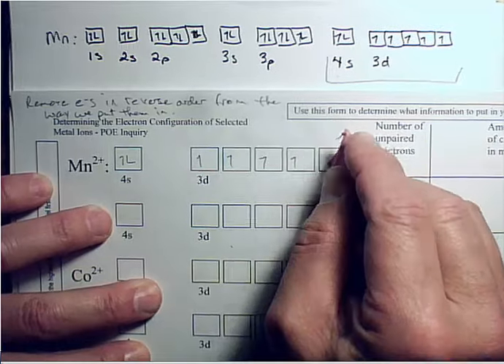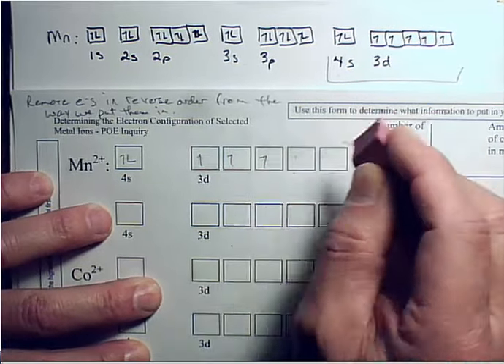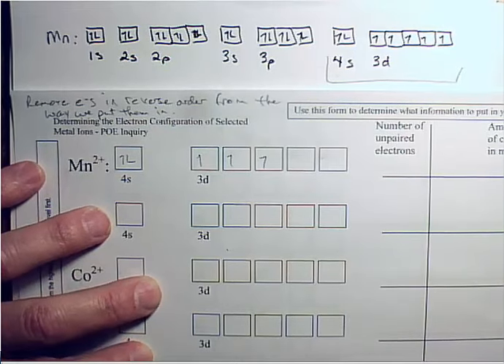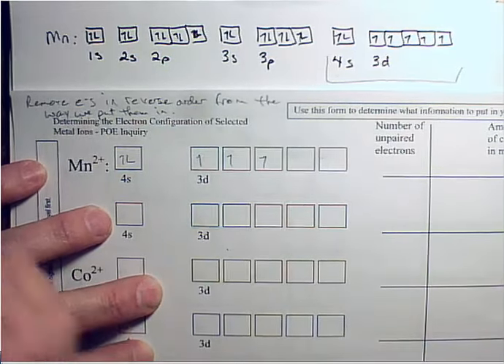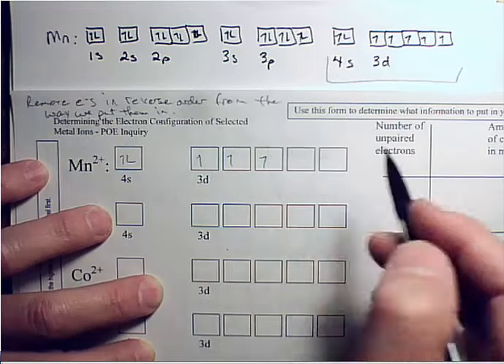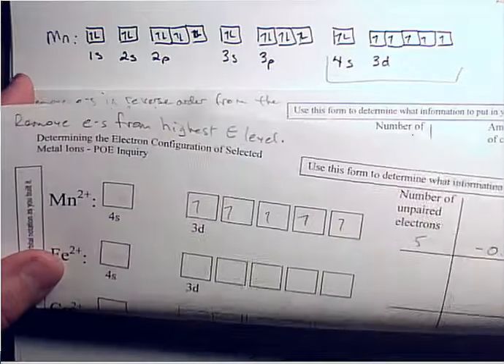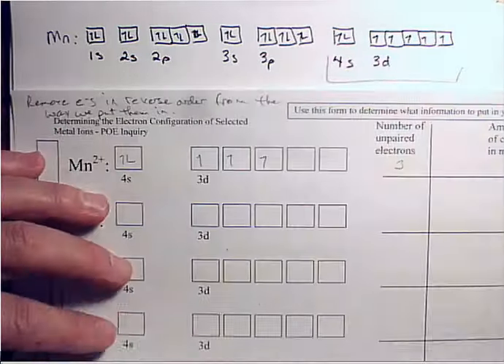Guys, if you're just waiting for me to give you an answer, you're not helping yourself very much. You need to be thinking this through and imagining in your own mind what's going to happen. How many unpaired electrons do we have now? 3. Okay? Now, the mass change doesn't change. The mass change you measure is going to be the same on both sides.